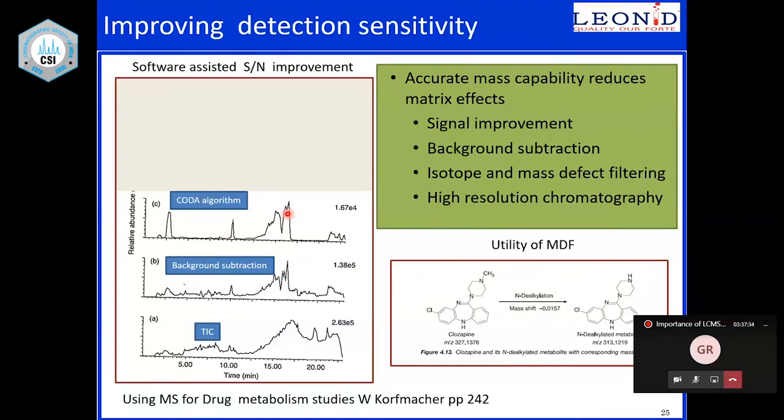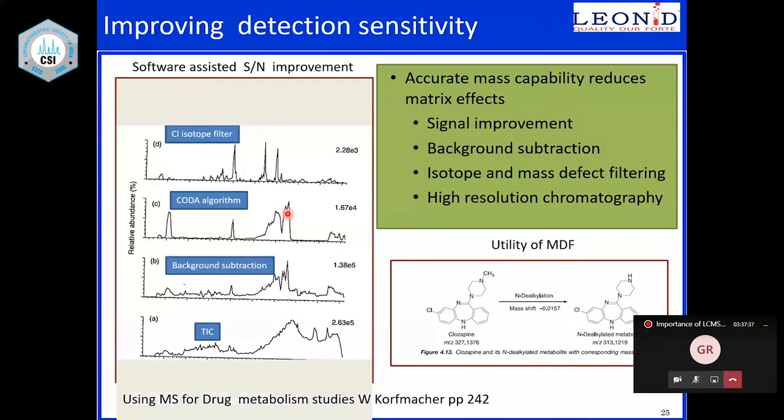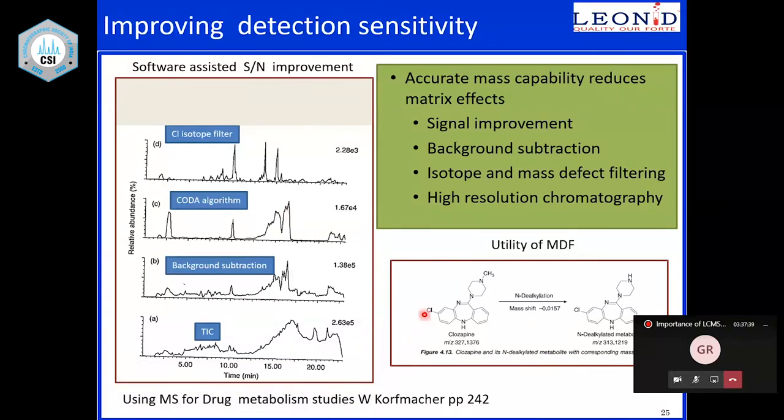Then you know that there is a chlorine in this molecule, in the clozapine molecule. I told you earlier, the moment there is a chlorine in the molecule, there will be the 1:3 isotope ions that can be seen. So you just tell the software that you are expecting a chlorine in your metabolite. Immediately it will apply a chlorine isotope filter to the whole acquired data. Look, this peak here contains the chlorine, this peak here contains the chlorine, and this peak here contains the chlorine. That means in my molecule, after my experiment, I am able to find three metabolites by using all these different filters. The basic is simple chromatography. It is the mass spec that has made it, and the software which has made all the tricks.